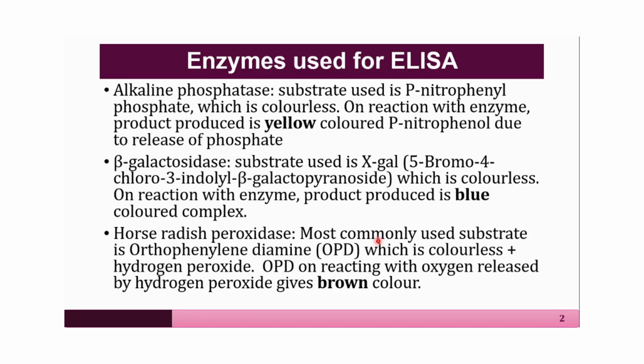It is the indicator that the reaction has taken place, and the yellow color can be measured by using a colorimeter or spectrophotometer at 420 nanometers.